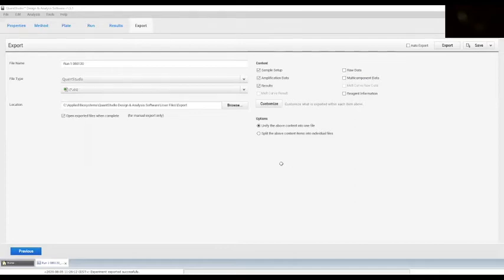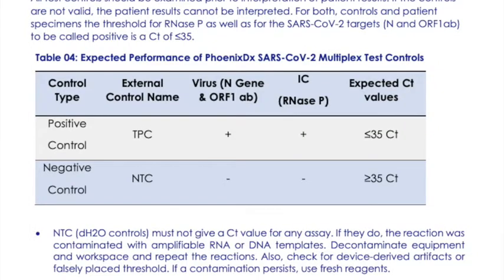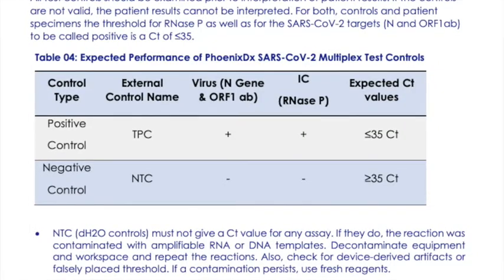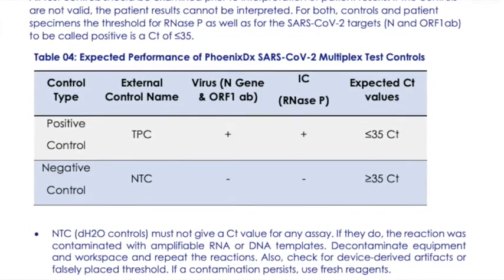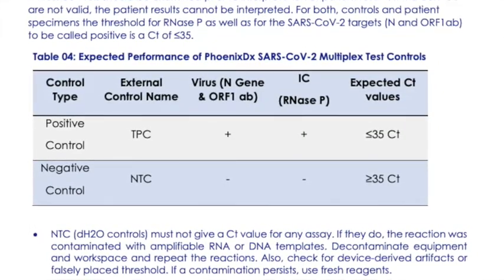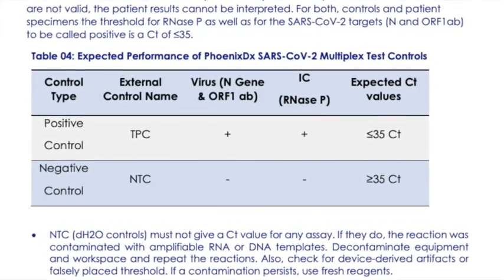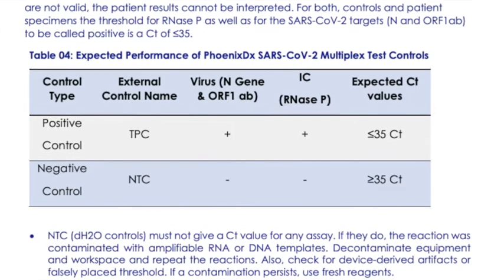Then click on export. Once you have the exported data in your excel file, at this stage please refer to the instructions for use page 11 and 12 for sample interpretation.